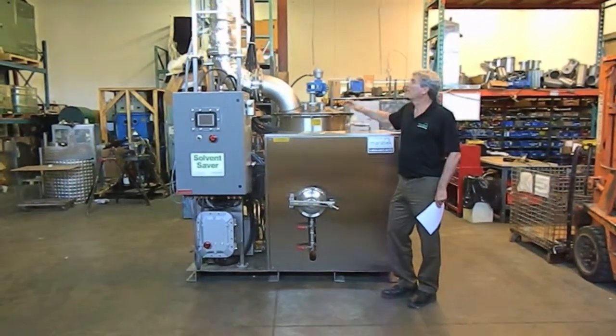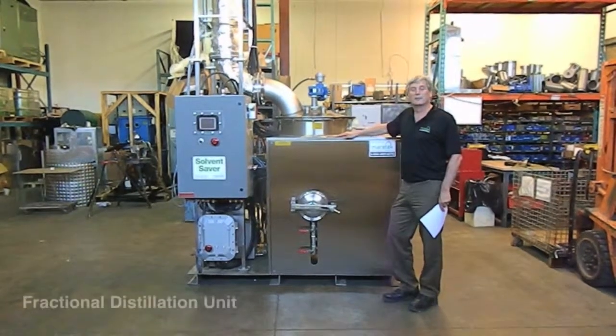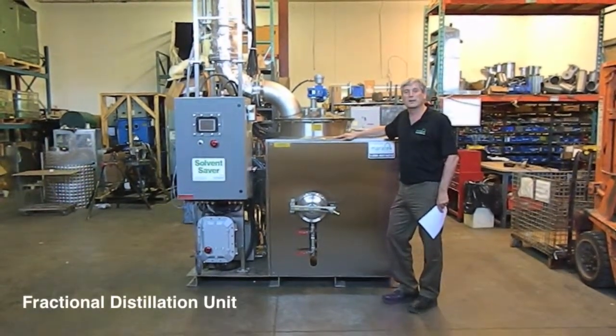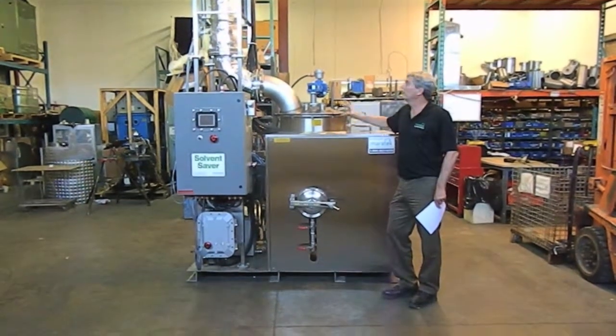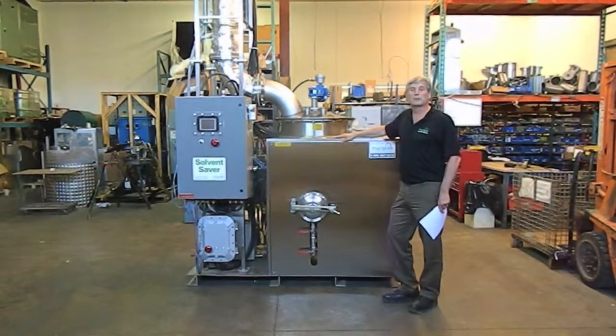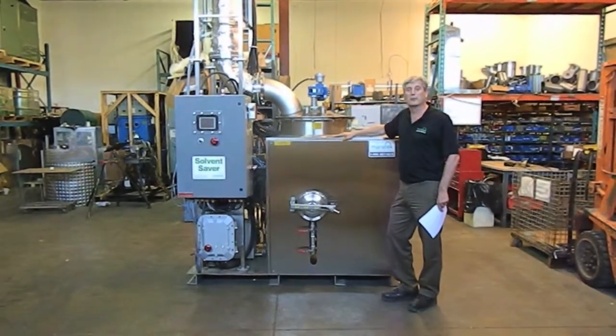This is an example of one of our latest machines. It's a fractional distillation unit that's going to a large pharmaceutical company in California. What it's doing is splitting out high-purity ethanol from a mixture of ethanol, water, and other impurities.